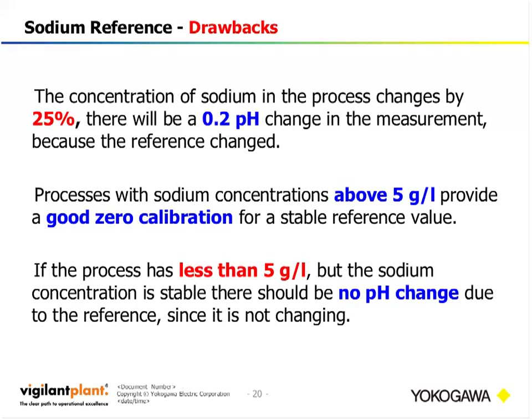But basically, to get rid of this pH shift, all you have to do is calibrate it out by doing a 1-point sample calibration to the process. And in most pH control applications, this 25% isn't even noticed. But obviously, pure water applications are not acceptable applications for these electrodes since there's theoretically little to no salts present.